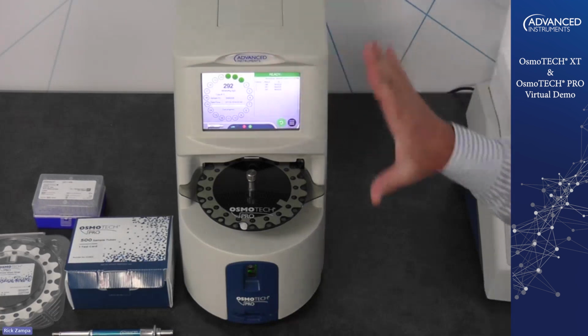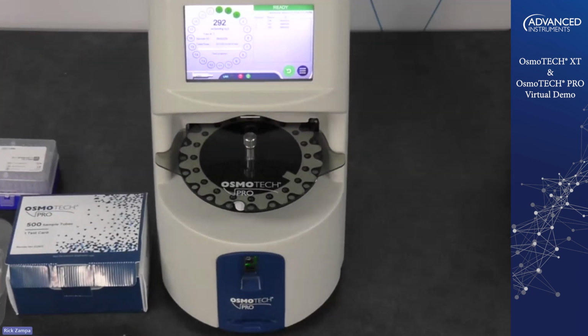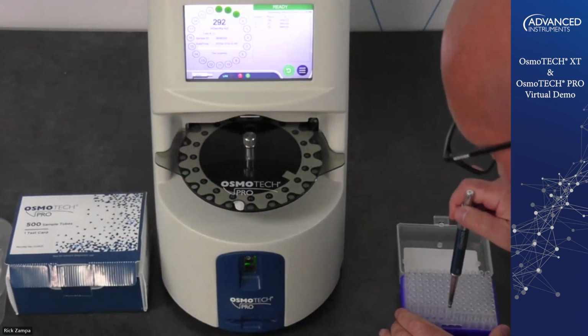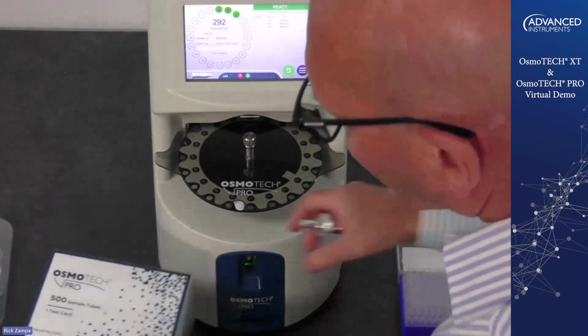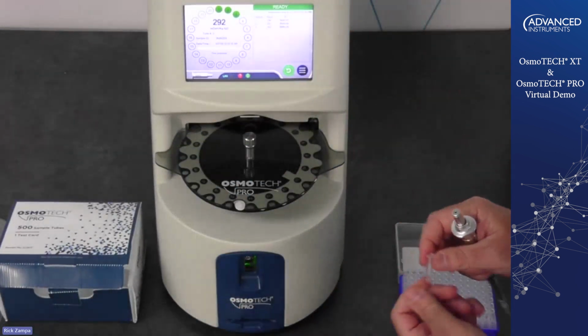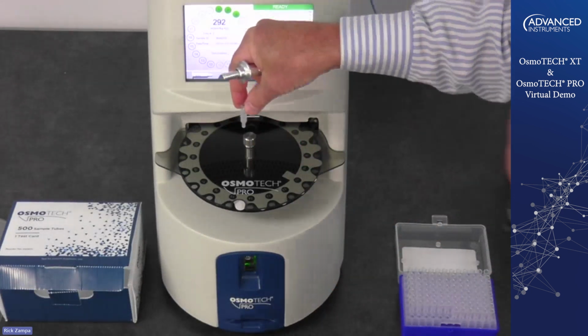And so what I'm going to do here is just quickly run a test on this one. And let's see if I can zoom in just a little bit more. There we go. So what I'm going to do now is I'm going to take my pipette. Excuse me, I got to grab my pipette tips here. So I'm going to get my 290 again. I'm going to grab a sample cup from our sample box here. This uses sample cups as opposed to the sample tips that we used over there. So this is the sample cup. If you can see that, that's our sample cup.